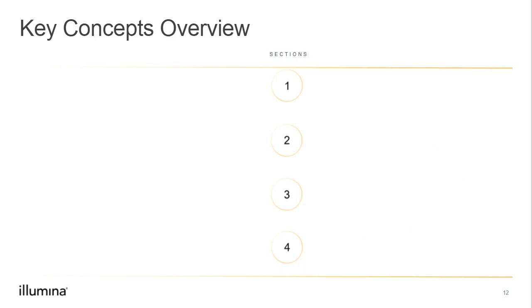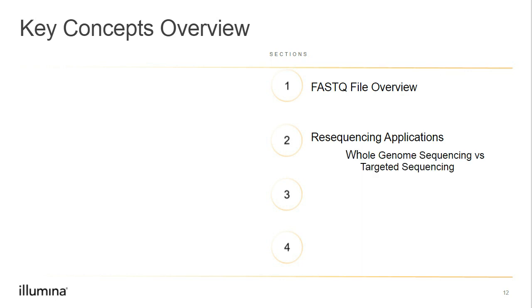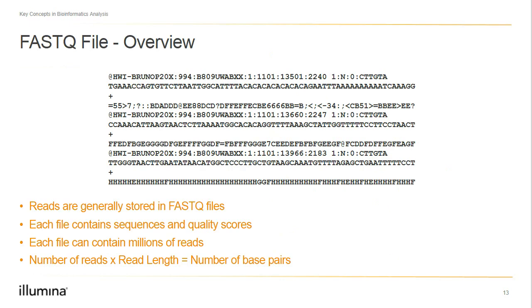In this section, we'll first discuss FASTQ files and how they're structured. We'll then move on to our resequencing applications, focusing on whole genome sequencing and targeted sequencing. We'll follow that with our assembly applications, and we'll wrap this section up with information about RNA sequencing.